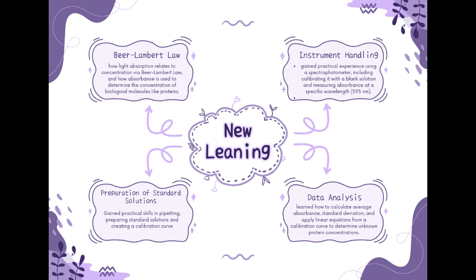spectrophotometer. This includes calibrating it using a blank solution and measuring the absorbance of samples at a wavelength of 595 nanometer. Another key area was the preparation of standard solutions. We have gained practical lab experience in pipetting, preparing standard protein solutions and using them to create a calibration curve, which is essential for quantitative analysis.